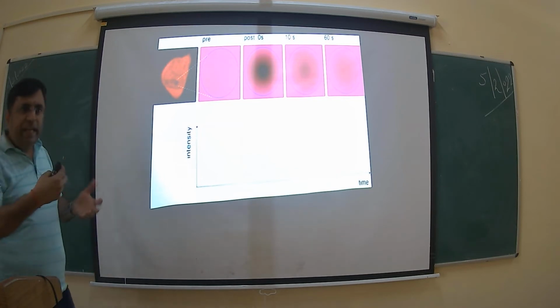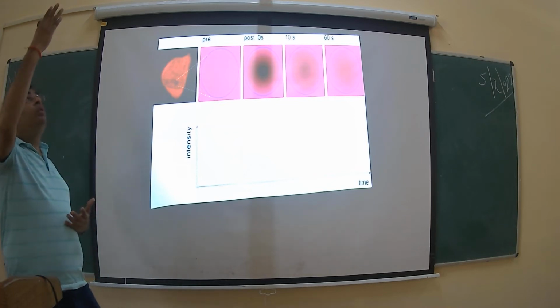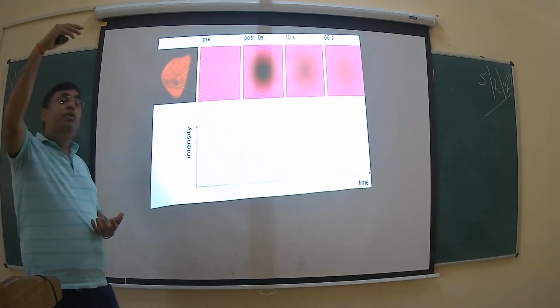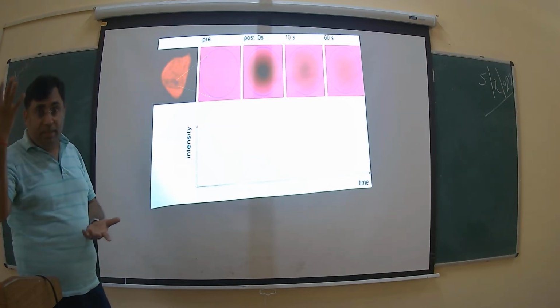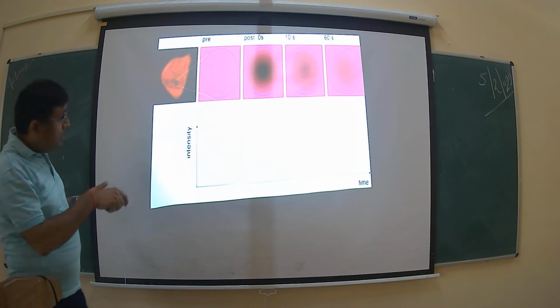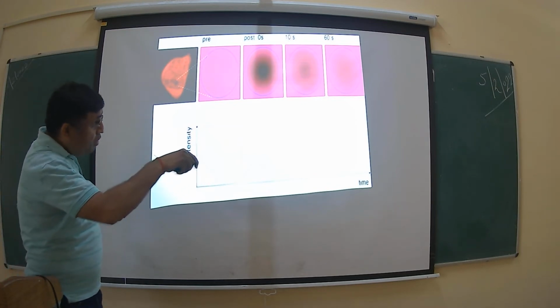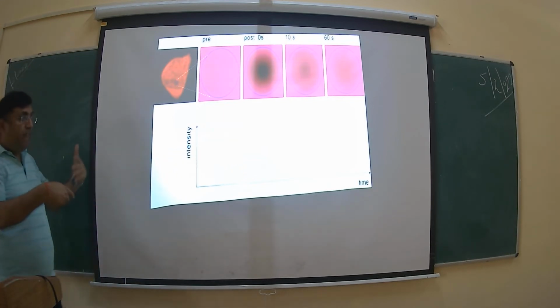That particular area will get recovered. Like what I told you, that I took out this rod and after 2 days someone changed it, then the recovery period of this rod is 2 days. Similarly, when the fluorescence recovers, we make a graph of this slope and accordingly we calculate.